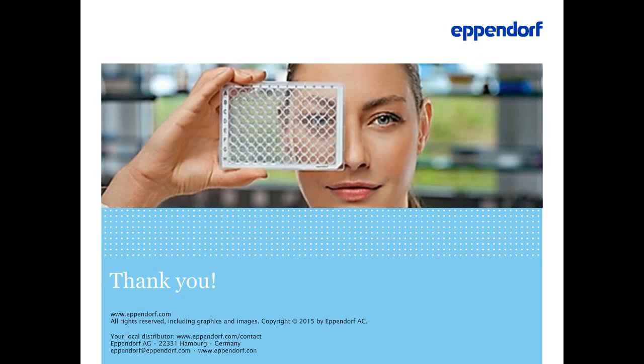Are leachables only relevant for assays with incubations in higher temperatures? Indeed, leaching is a temperature-dependent process, and generally speaking, the higher the temperature, the more leaching occurs. There is, however, extensive scientific evidence that many critical additives, like slip agents, can leach already and strongly influence various experiments at lower temperatures, also at room temperature. Examples include various enzymatic assays, receptor binding, and many others. In the end, it is difficult to predict which assay to which extent will be influenced by a given additive. I think the best practice would be to avoid the critical additives completely.